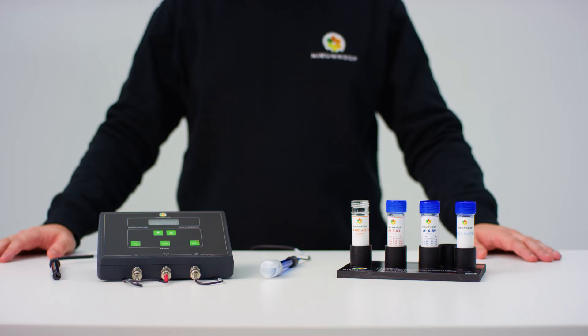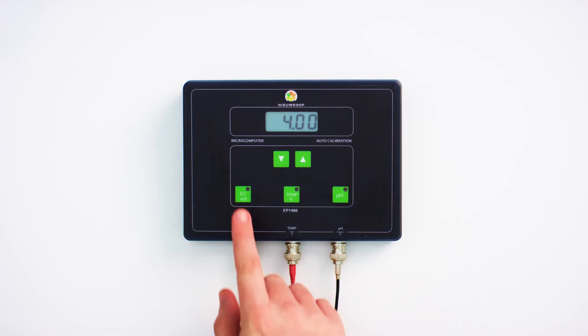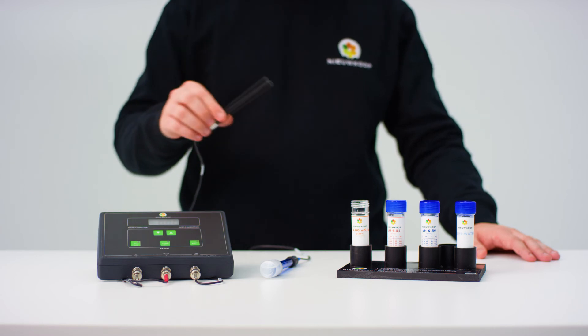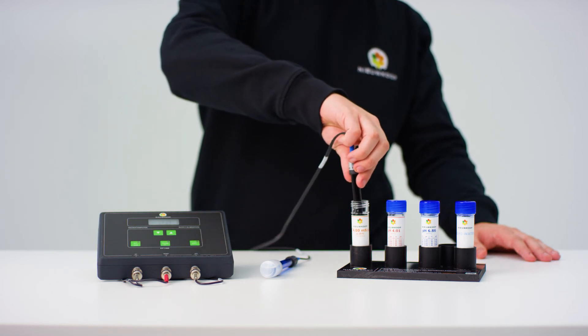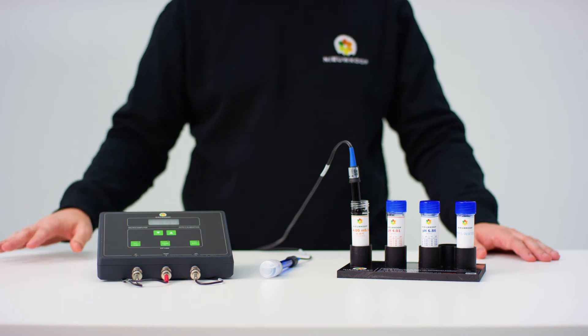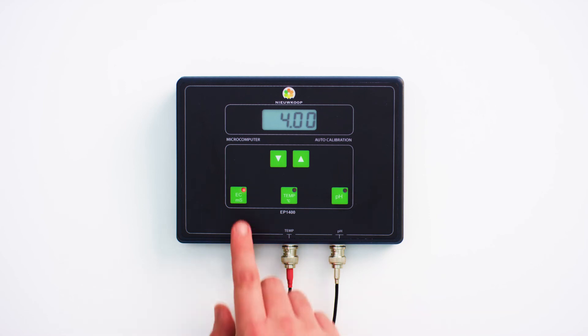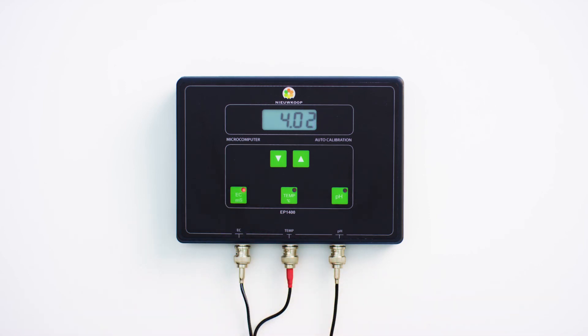We now proceed to calibrate the EC. Press the EC button to put the instrument in this mode. Place the sensor in the tube containing EC 4.00 liquid. Stir briefly to remove any air bubbles. The reading will blink and the tilde sign will appear in the top left of the screen, meaning the instrument is calibrating. When the mark disappears and 4.00 is shown in the display, the instrument has finished calibrating. Now press and hold the EC key until the LED on the key starts flashing.